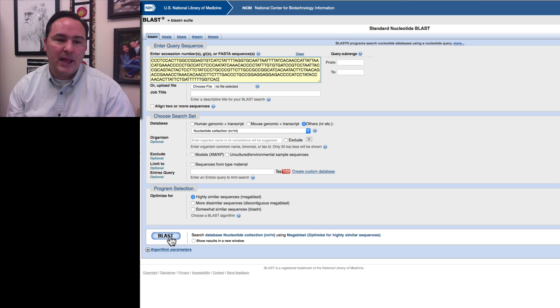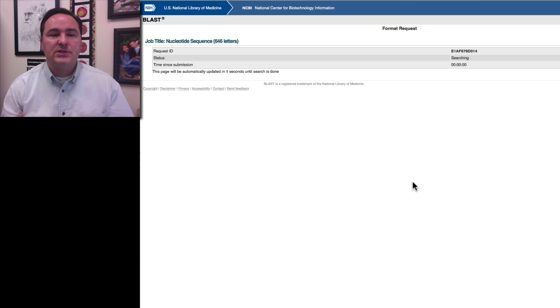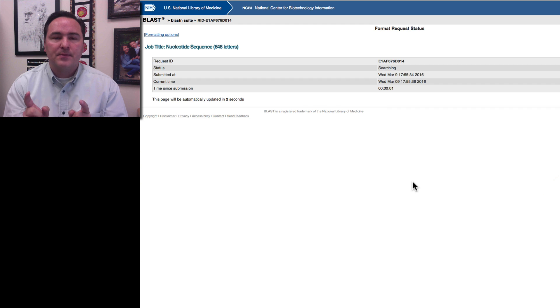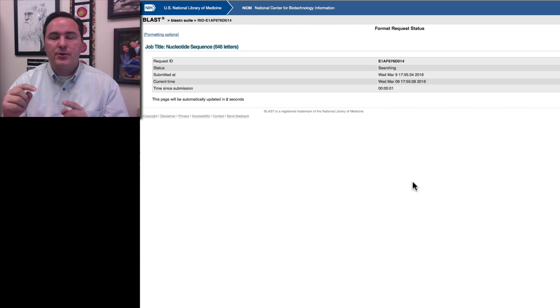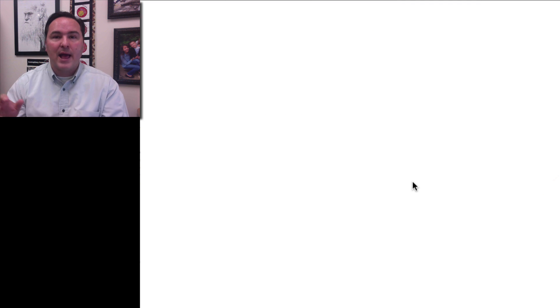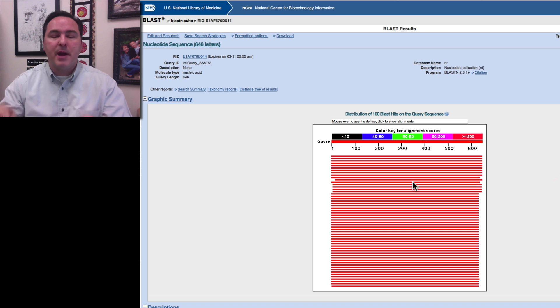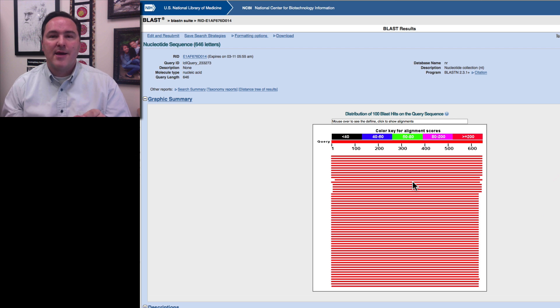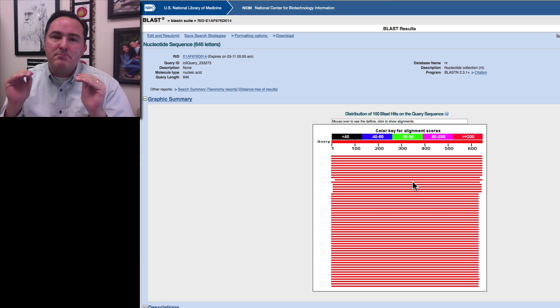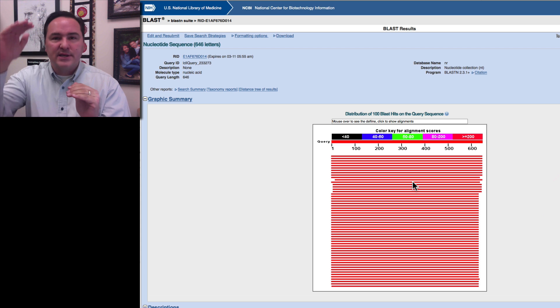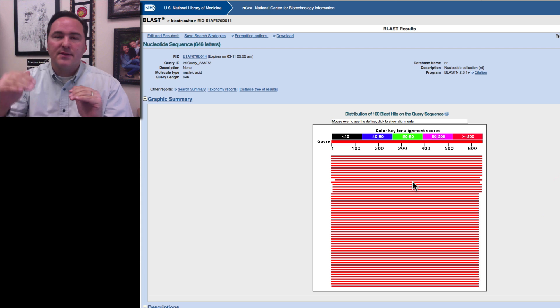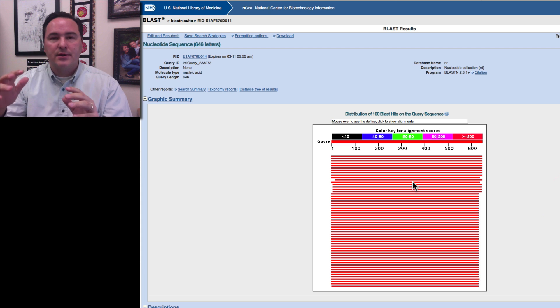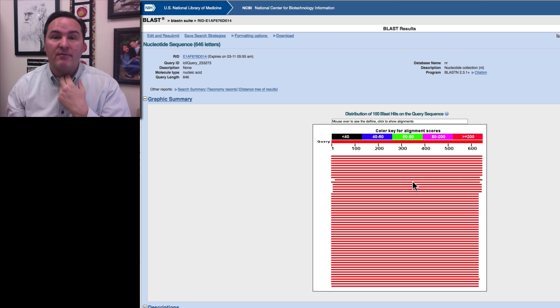And then you can leave everything else on the default value, and then just click Blast. And so, what this is doing now is it's taking that sequence, it's now submitting it to a program, an algorithm, that is comparing that sequence to every other known sequence. Anything that is the most similar is going to be the highest on this list that comes up, and things that are less similar wouldn't have been found.